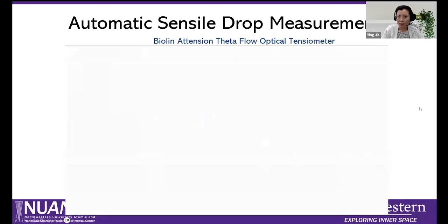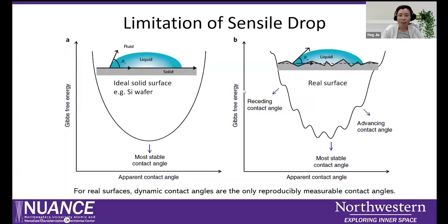Okay. Next slide. So again, contact angle is not limited to this basic static contact angle measurement. It also has more than that. This slide shows why we should consider more than just static contact angle.